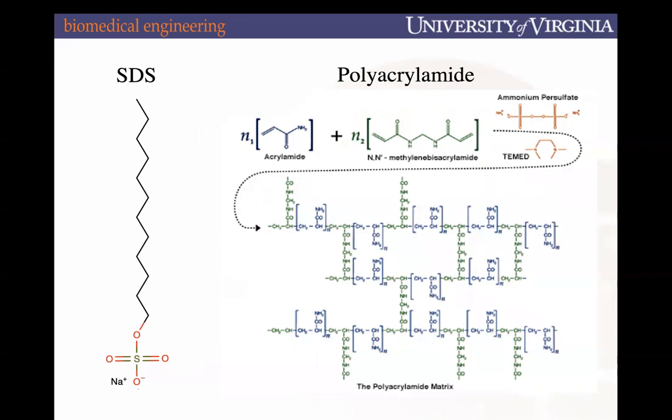And the polyacrylamide network is actually a combination of both acrylamide and bisacrylamide. What's key to note here is that bisacrylamide creates the cross links between different segments of the chain between acrylamide networks here. And just one last thing I want to say: ammonium persulfate and TEMED are important for the radical polymerization that promotes this network to occur. One last key thing, or two more key things.